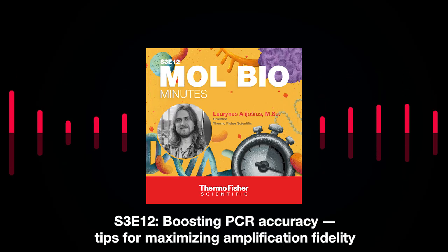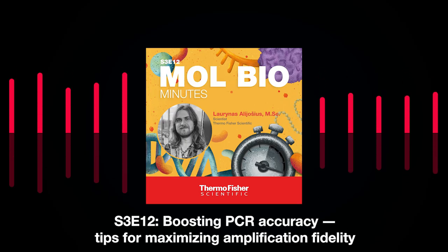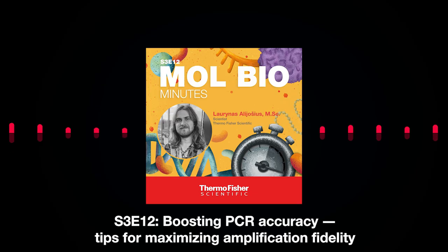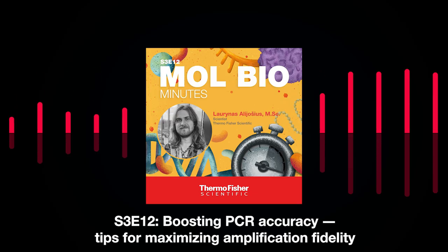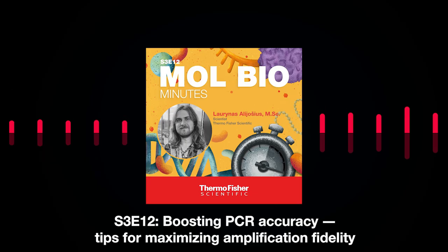But you can also optimize other steps of PCR as well. Let's say the primer annealing step, the temperature of this step. You need to align the temperature with your designed primers to ensure that your primers will bind specifically and they will not provide some non-specific amplification.